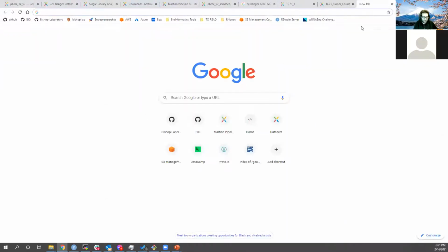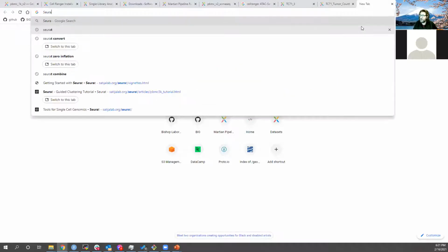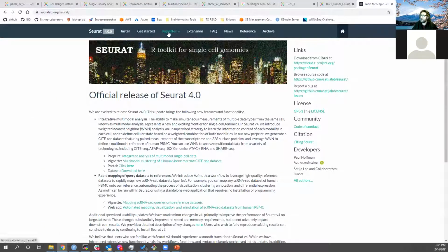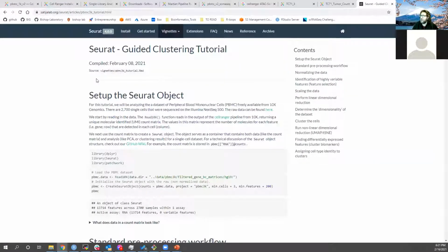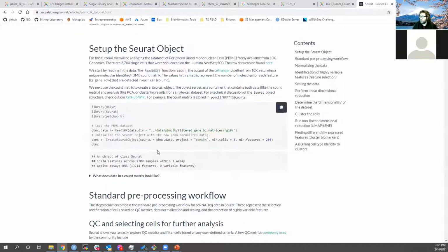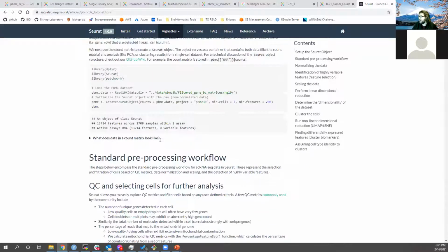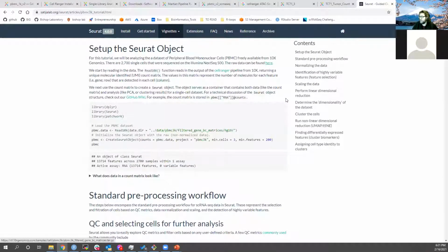All right, this is kind of convoluted, so my apologies. If you go to the scRNA PBMC 3K guided tutorial, which is what we're in essence following at the moment, and go down to where they get their data from, you can see it right here.